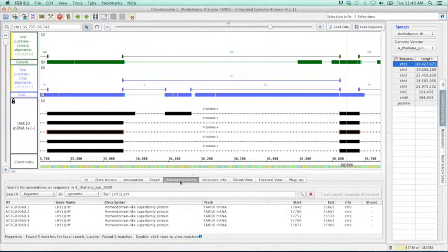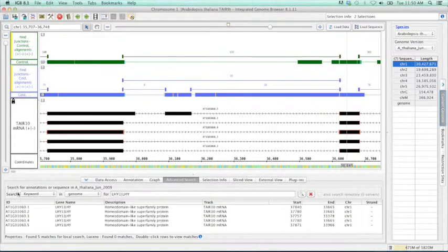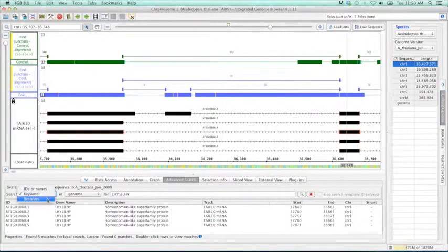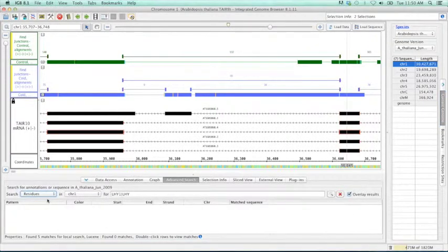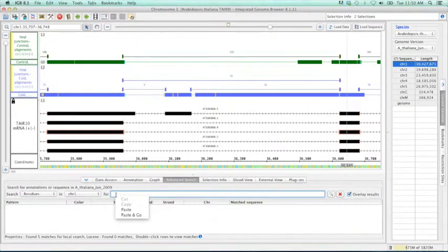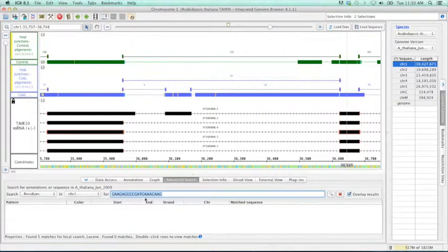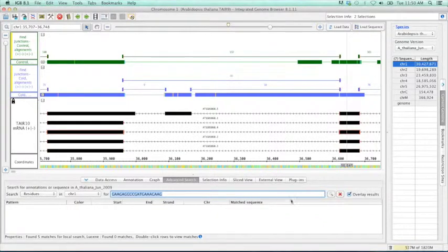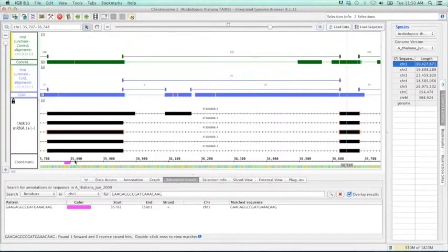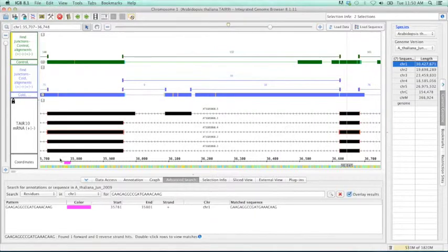In order to search for primers or residues, we would use the Advanced Search tab. In the Advanced Search, go down to this Search dropdown box, select Residues. I'm just going to get rid of that. Then we're going to paste in our first forward primer and search. As you can see, IGBI has very quickly found it and located it within our left flanking exon.